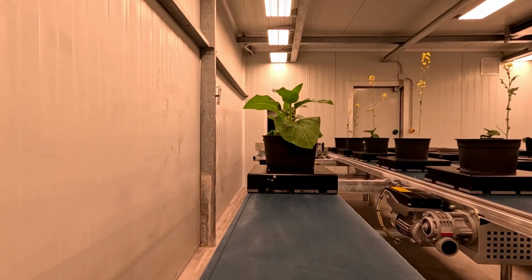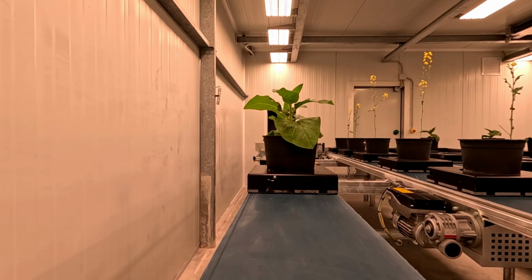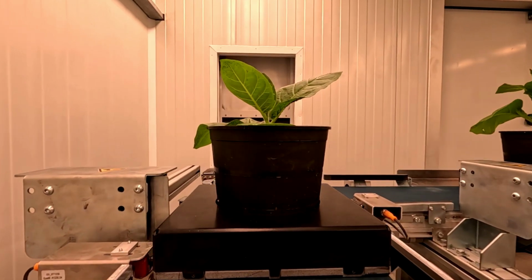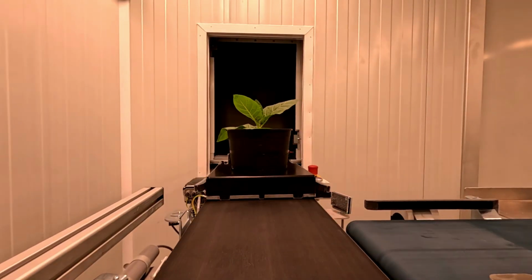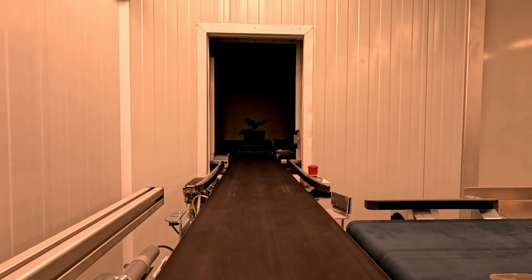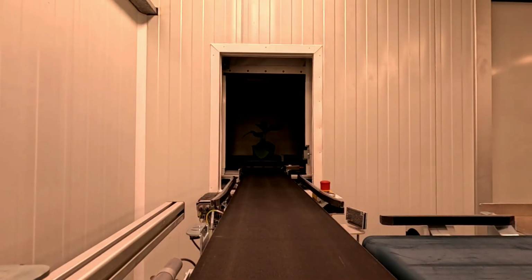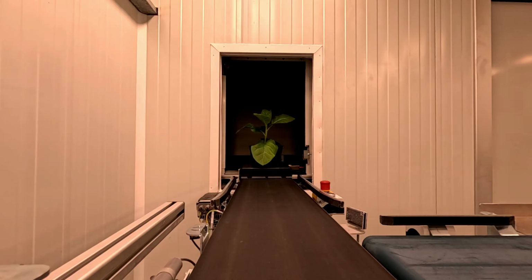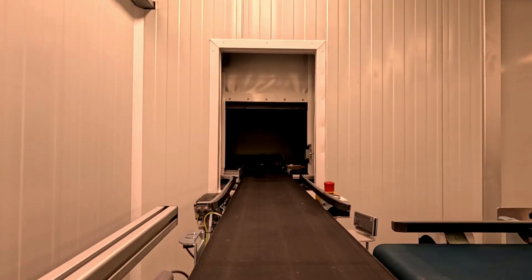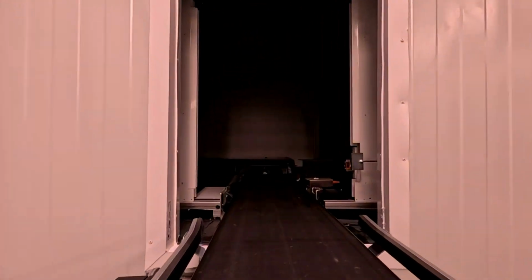For each data acquisition, the plants are carried on the conveyor system towards the imaging cabinet, enter into the cabinet, and images are acquired inside. After imaging, the plants come out of the imaging cabinet and move back towards the growing area.